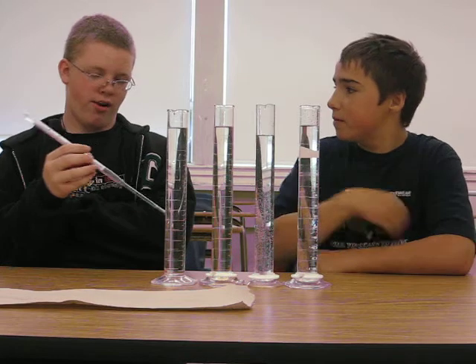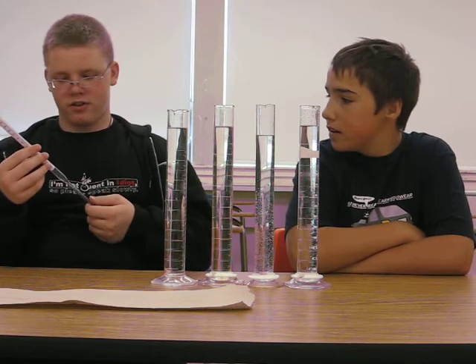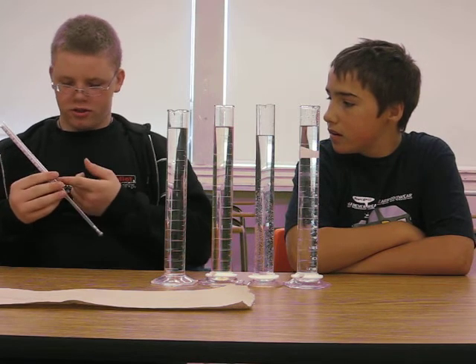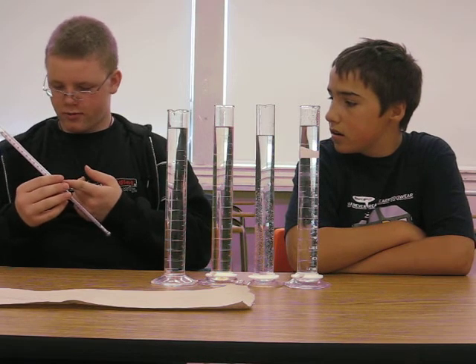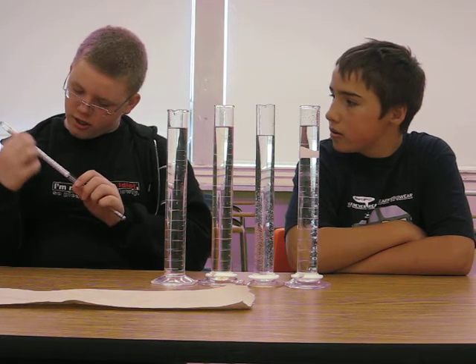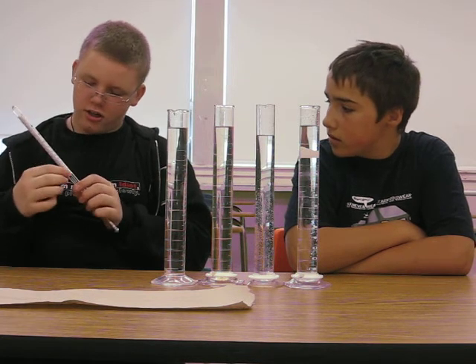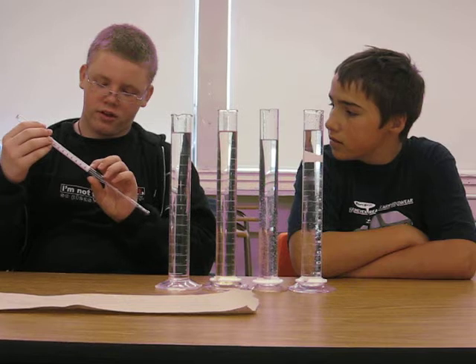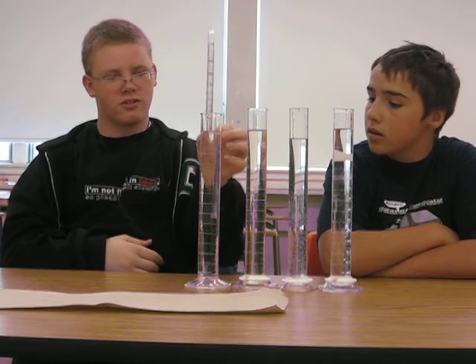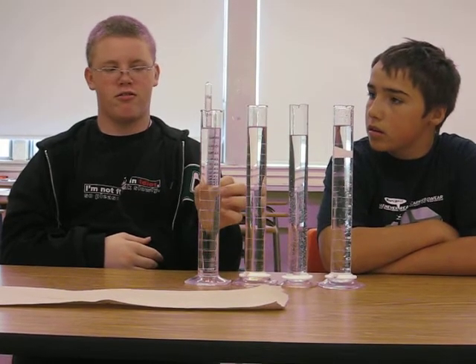It's not like a thermometer because the thermometer measures temperature — this measures density. It gets less dense up here and more dense down here. So if the liquid is more dense, it will float more. If it's less dense, it will go down like that.